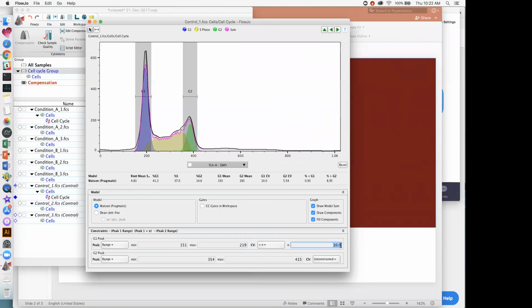You can step this back a little bit one by one to see if some of these minor changes are going to improve the model significantly. Generally speaking, if you're within, I don't know, 0.5 units, at that point you're talking pretty minimal amounts, and you shouldn't be too concerned with how far away you are from the model's previous setting.